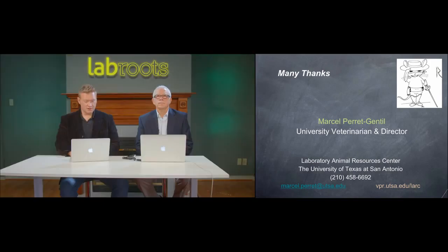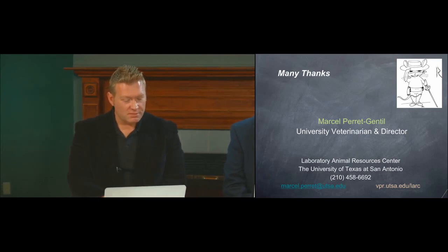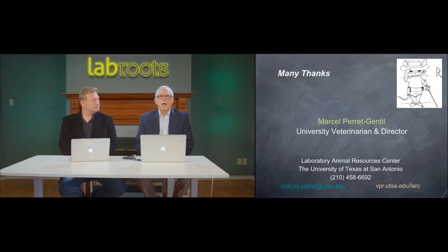Thank you, sir. And another question is more about surgeries and instruments. The question is from Bruna. Of course, I picked the hard one to pronounce. Bruna Mora Cuddy from McGill University. The question was, I noticed that many researchers are placing instruments in 70% alcohol during and between multiple surgeries. What are your thoughts on this practice?